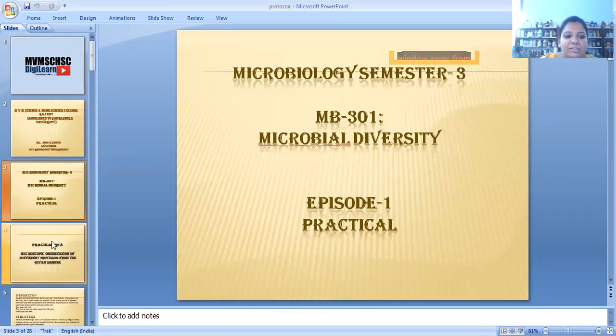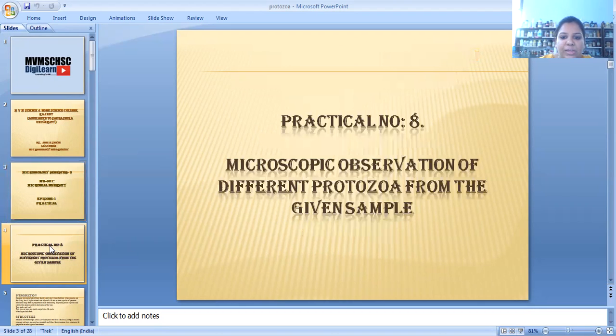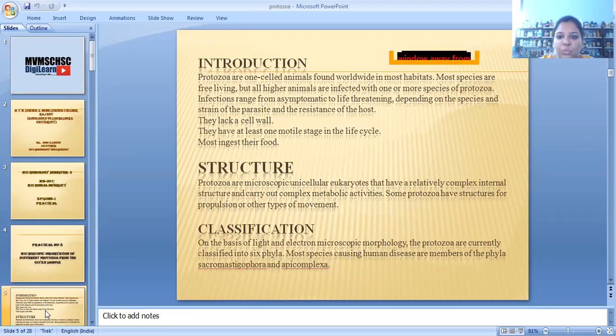So, which practicals are there? Their list is already with you. From that list, today we are going to discuss practical number 8, that is microscopic observation of different protozoa from the given sample. Now, to begin with, what are protozoa?